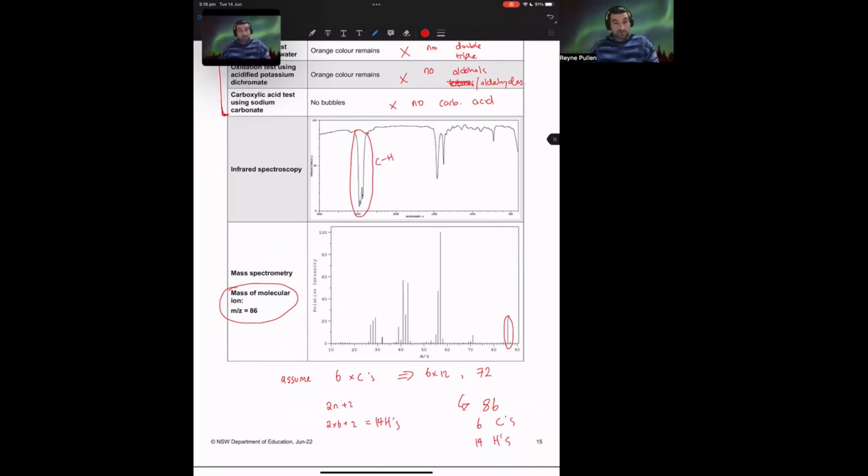I'm not sure if you go into stretches or bonds, but if you look up things online, you'll see that that's actually going to be the carbon to hydrogen stretch. Whereas these peaks that we see here are likely going to be the carbon to hydrogen bend, okay? And then as a reminder, and I think Stephen mentioned this for sample A, we don't really deal with this. So this is the fingerprint.